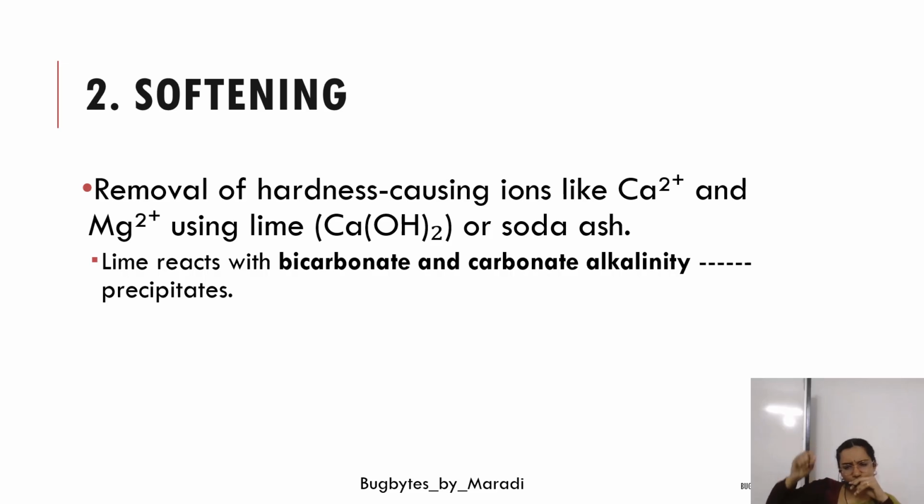If the alkalinity is very low, more chemicals are needed, or the process may fail in the end. So if the alkalinity is low, more chemicals are needed. Vice versa, if the alkalinity is very high, fewer chemicals will be required.